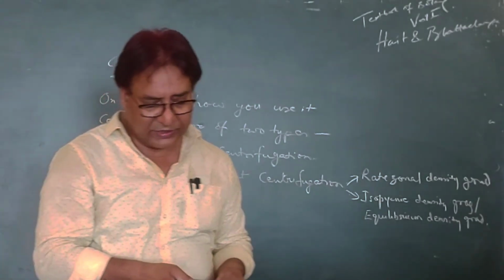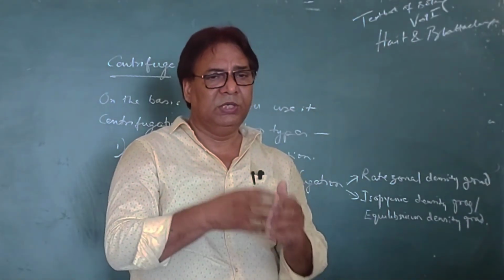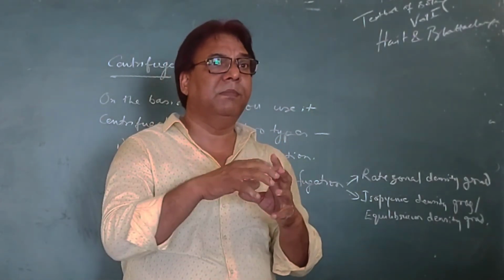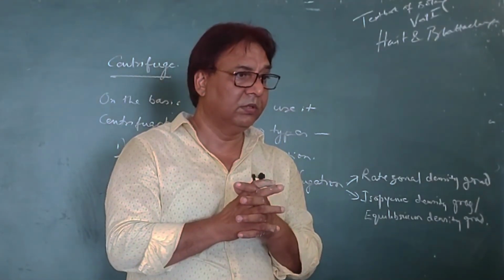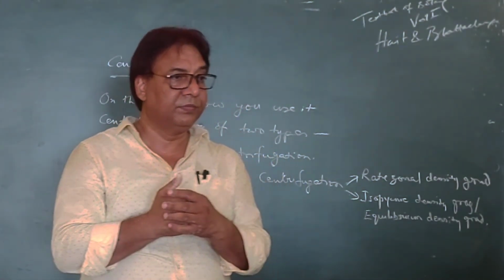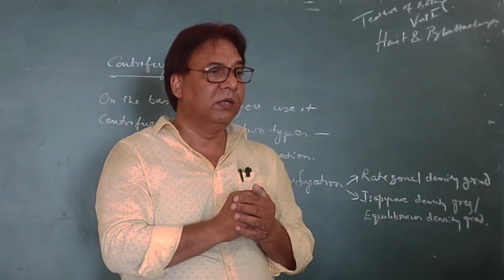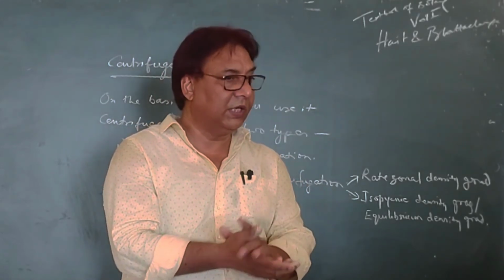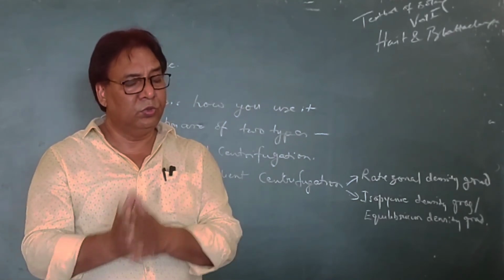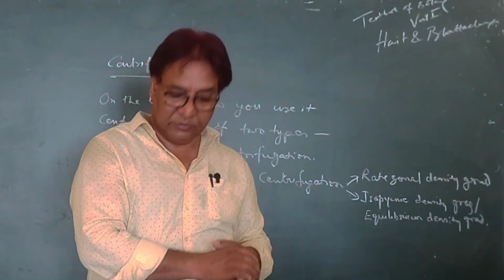In my lab, we used to use, it was not exactly my work, my colleagues. My work was a little bit different. It was purely genetic engineering. But my fellow friends used to separate mitochondria from Leishmania donovani. Leishmania, you remember, is the pathogen of Kala-azar. And Leishmania has only one mitochondrion that is equal to the size of the nucleus. That's what I was saying there. So separating it is a difficult task. You need to do this density gradient centrifugation.